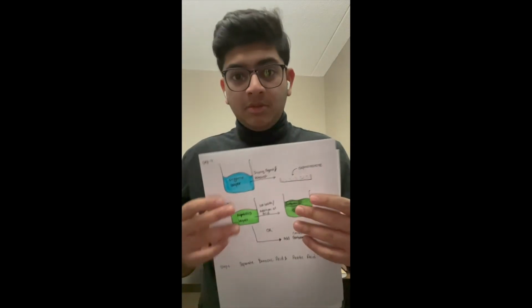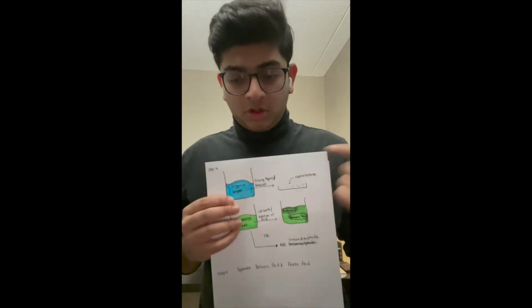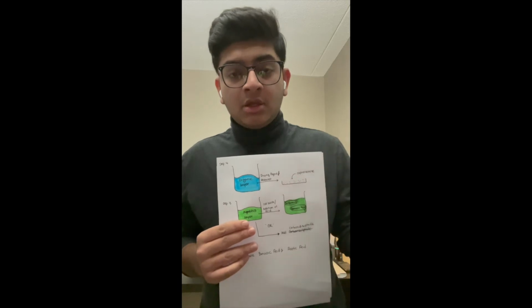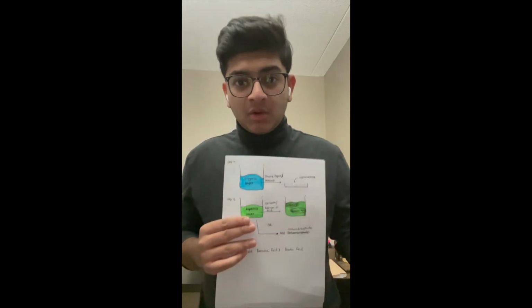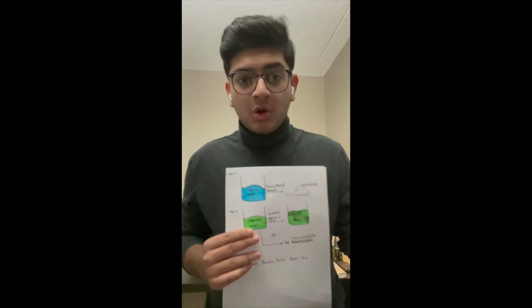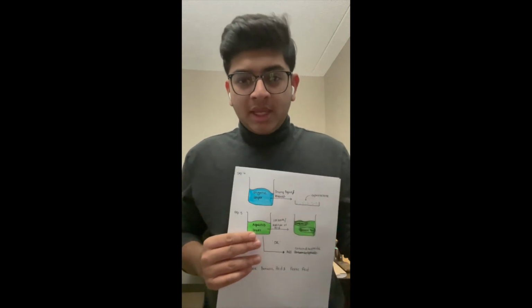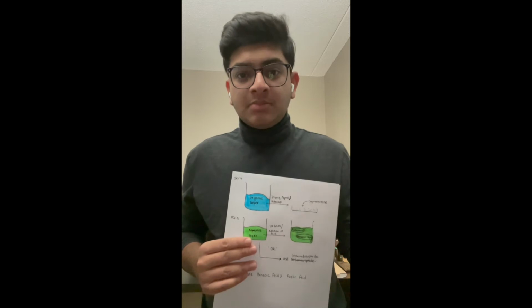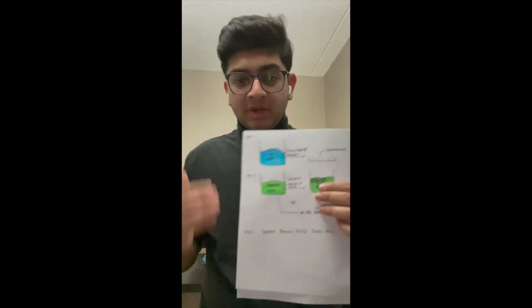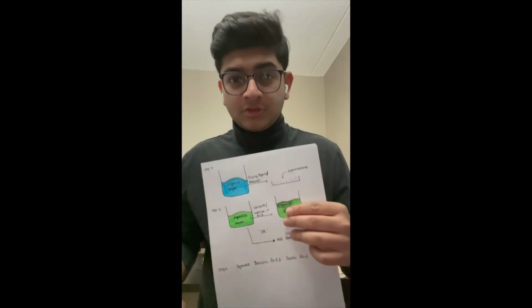Now, before we put the organic layer into the rotavap, we add a drying agent to it so that we can remove any leftover aqueous impurities that might be present after the process of extraction or washing. The drying agents are numerous, but the one that we use would be sodium sulfate because it is available very easily. It is easy to use for the students and is also inexpensive.